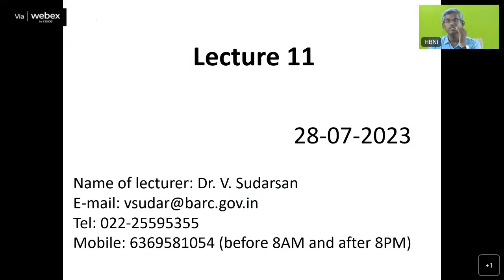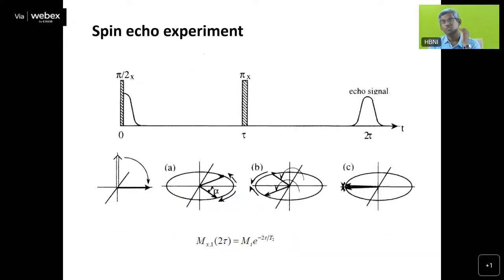Now let us discuss in detail what a spin echo experiment is, which we have already defined, and how it can be used for understanding structural information. The same thing I am showing here once again to refresh your memory.